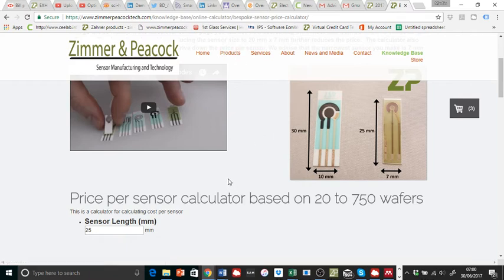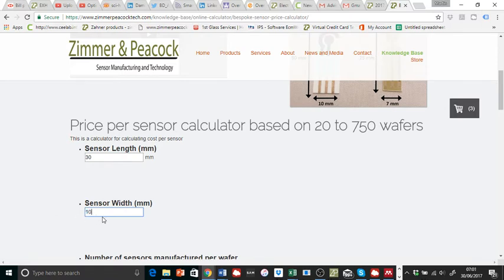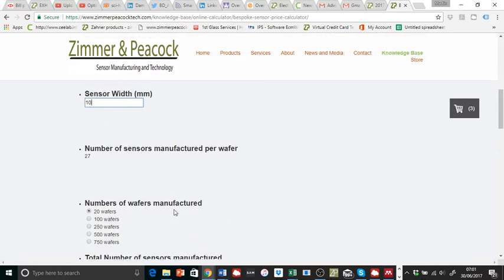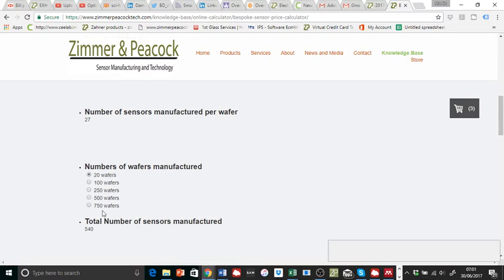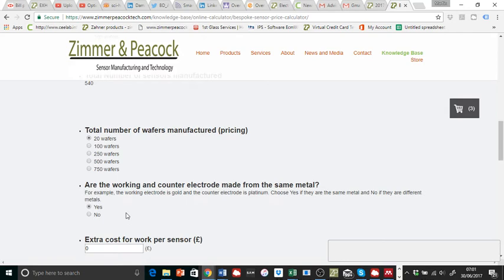I'm going to assume that this customer wants a 30 millimeter long sensor that's 10 millimeters. It's on alumina. It's got gold connectors. They only want a small number of sensors, which is 20 wafers. So I'll make it 20 wafers. The next question is, are the working and counter electrode made from the same metal? The answer is yes, they're both platinum.